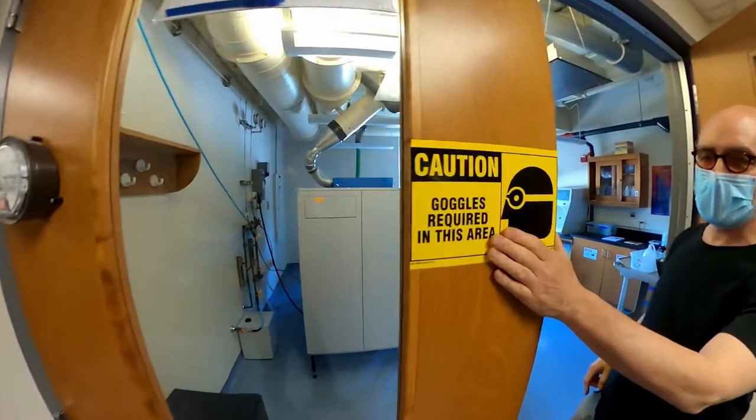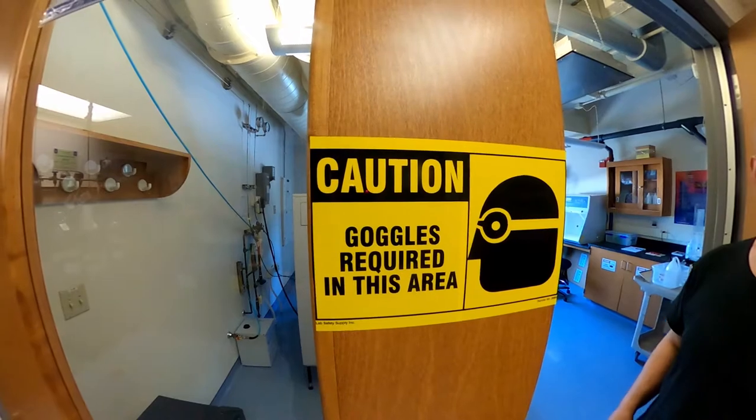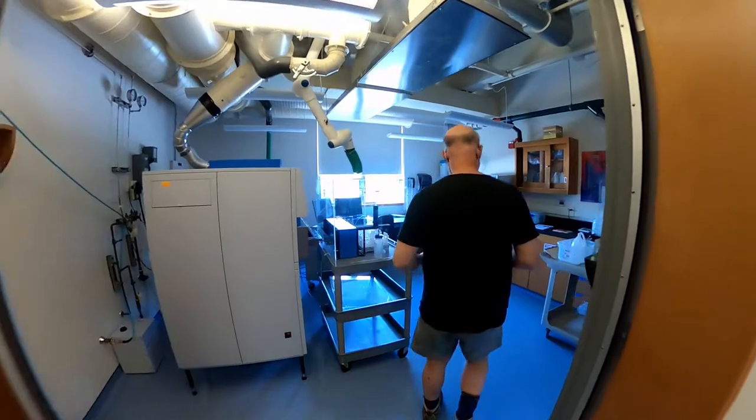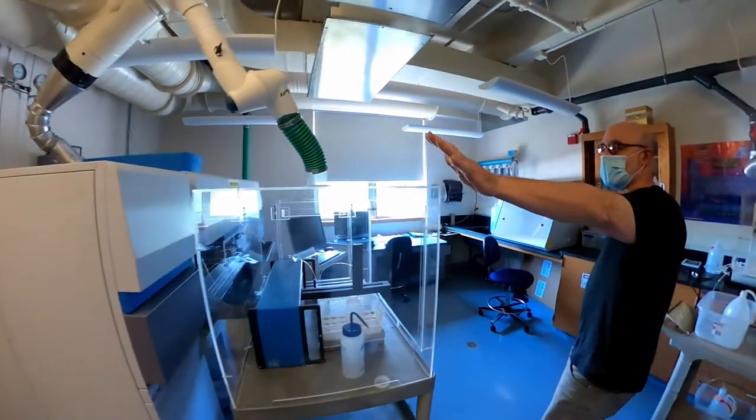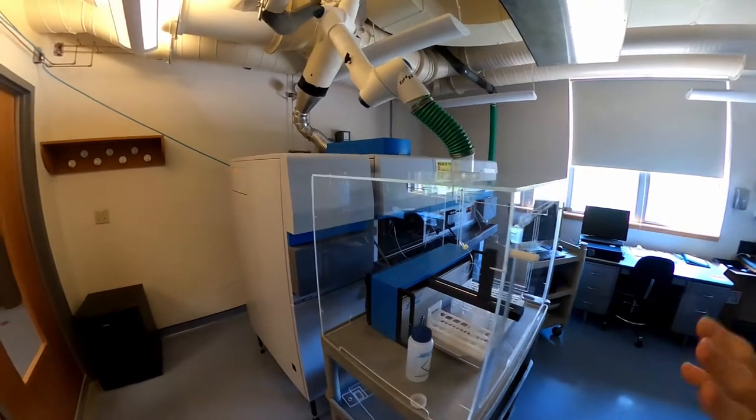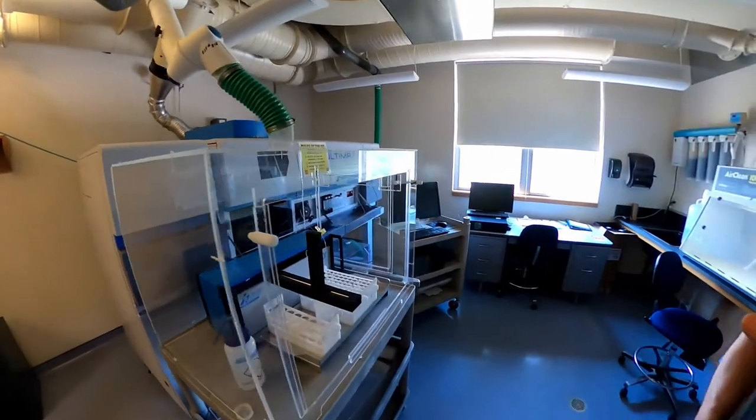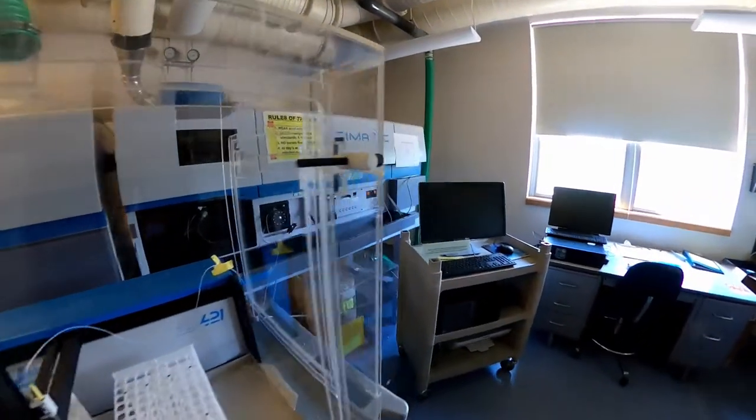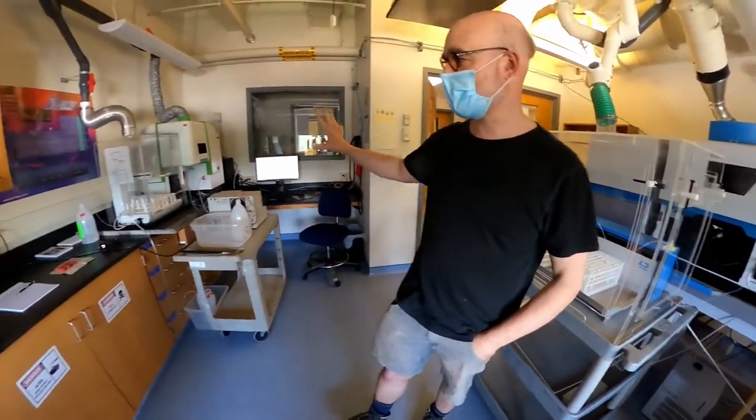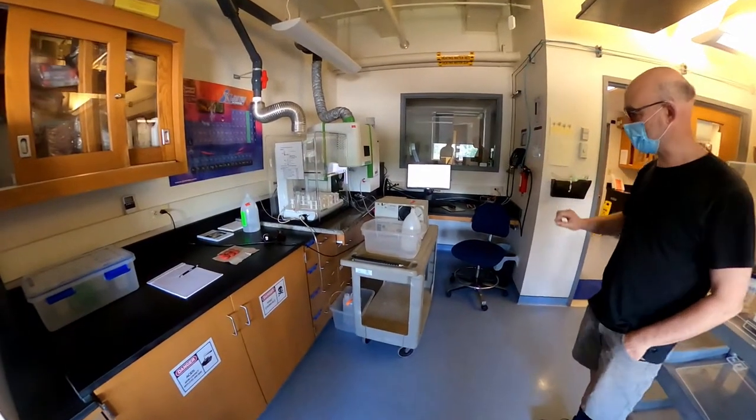We must wear goggles when we're mixing chemicals in here or glasses. I've got my glasses on right now to protect my eyes. We have two ICPs. We have the big ICPs, about 20 years old. Very sensitive, good for running lots of elements at once, but a bit tricky because it's 20 years old. It's a little cranky. And then we have this new machine that we just got last year, which has much nicer software and much easier to use. And that's what we're going to be working on today.